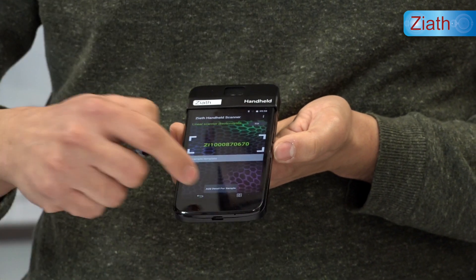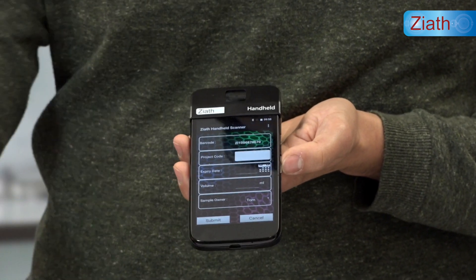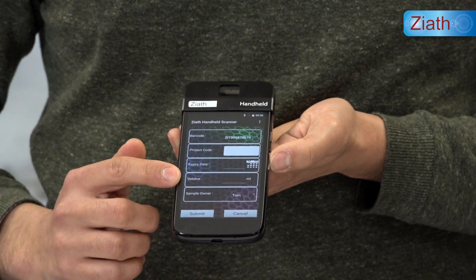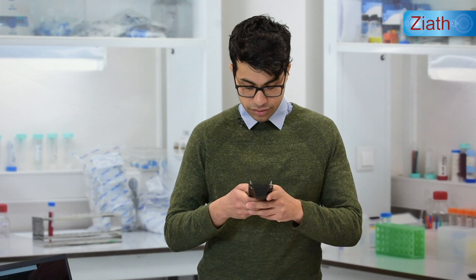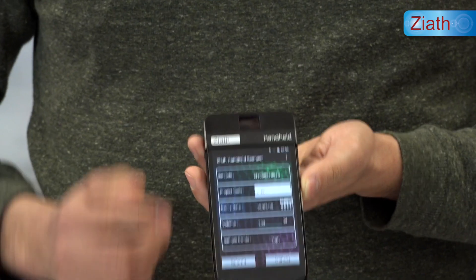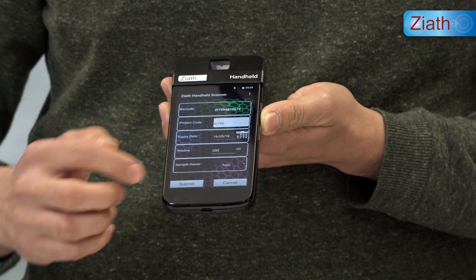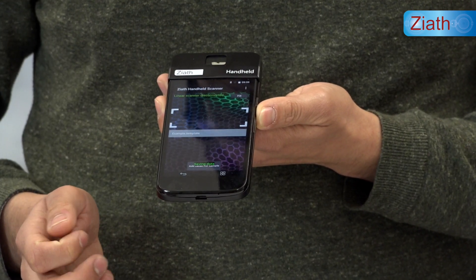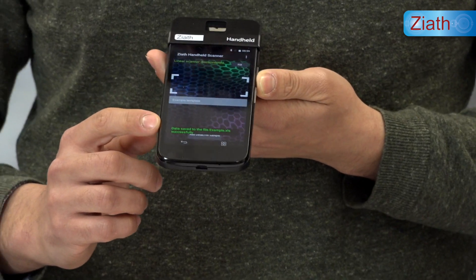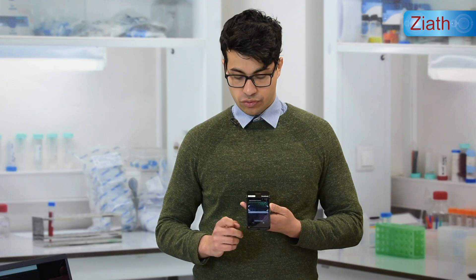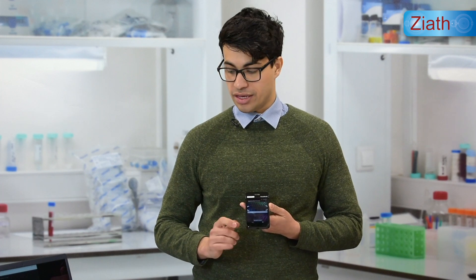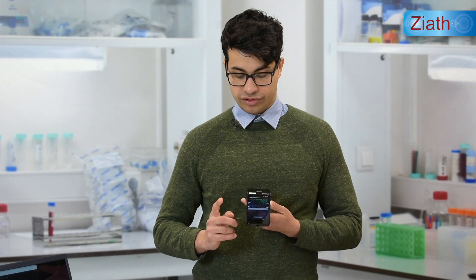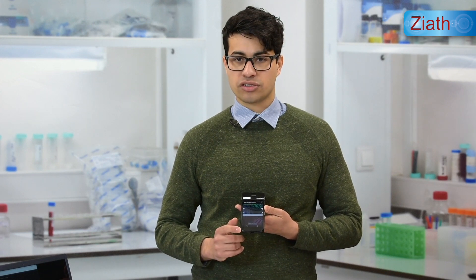We can then scan the sample and add details for the sample. The fields that we created on the template can be seen on screen. I've added some dummy information which can be seen here. If I click submit, this will save the sample information onto the handheld. To retrieve the information, we plug the handheld back into the computer via the micro USB cable, then take the handheld file we just created and save it onto the computer. It will be saved as an Excel file.